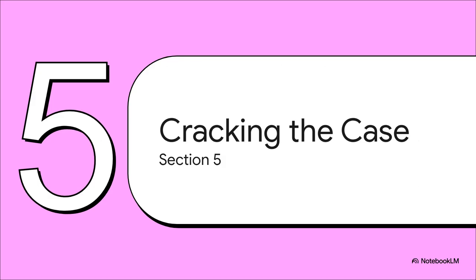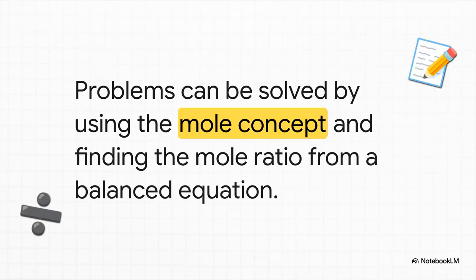So, we've done the experiment. We've found our endpoint. We've carefully written down the volume from our burette. Now, it's time to do a little math and crack this case wide open. This is where all the pieces of the puzzle just click into place. See, because we know the precise volume and concentration of our standard solution, we can figure out the exact amount of it we used. Chemists have a special unit for this. They call it a mole.